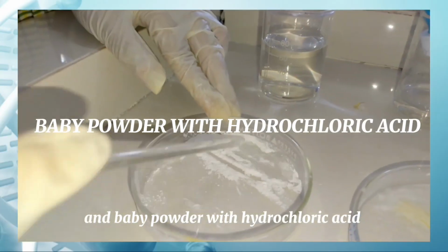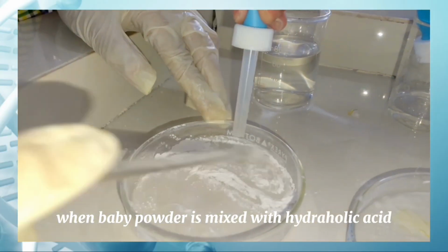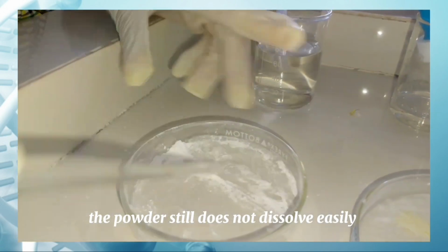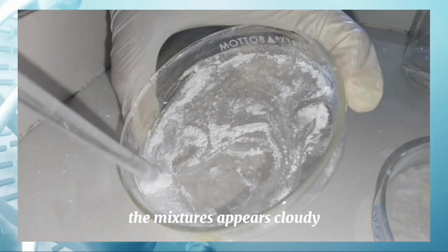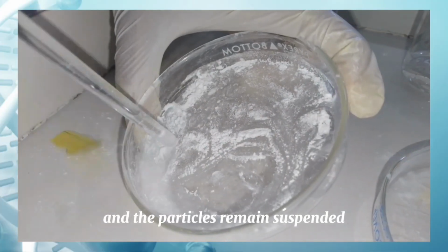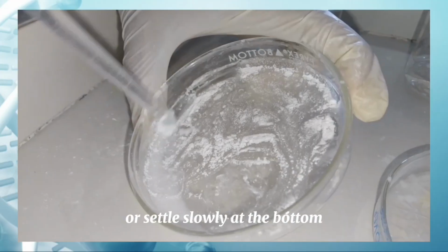Baby powder with hydrochloric acid. When baby powder is mixed with hydrochloric acid, the powder still does not dissolve easily. The mixture appears cloudy, and the particles remain suspended or settle slowly at the bottom.